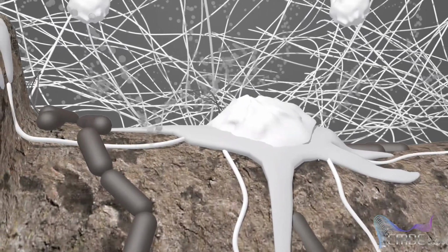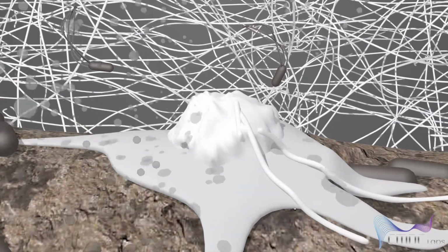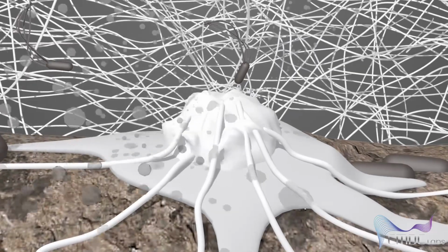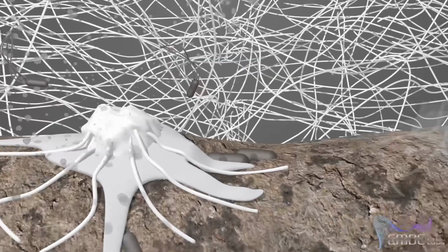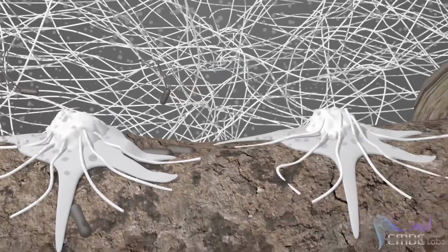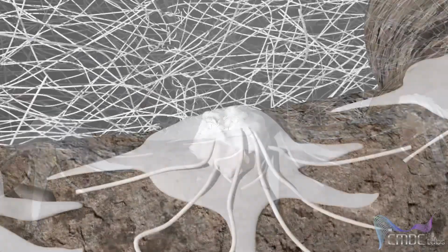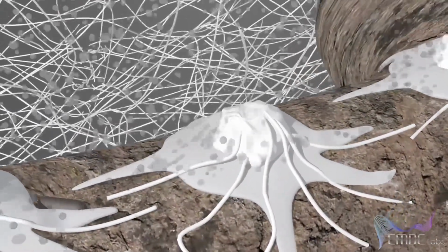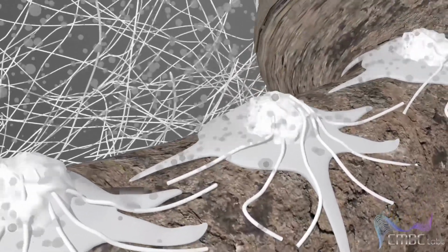When recruited, monocytes and macrophages perform as secondary responders, at which point they predominate to phagocytose remaining bacteria or tissue debris and remedy any unresolved inflammation. During the second step of this process, monocytes and macrophages are introduced via the CT chamber into a soluble messenger factor rich environment that is being primed by PMNs through a proprietary filter in order to evaluate their response to the extracellular environment and implant surface.